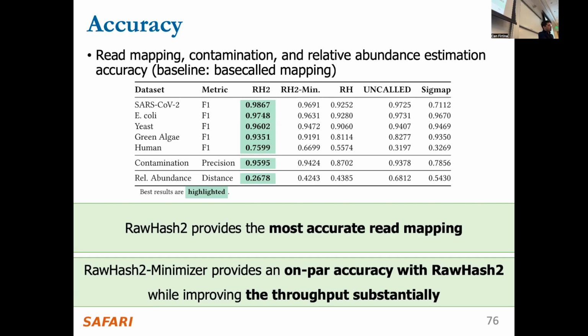We did some empirical analysis to see what we can achieve with accuracy without really caring about performance, the speed. We played with certain parameters just to see whether our seed matching approach is limited by something, and what the limit is. The best F1 score we saw was around 0.9 for the human genome. But then the computation is pretty slow, because you either have too many matches, or too many chaining computations that you need to make.